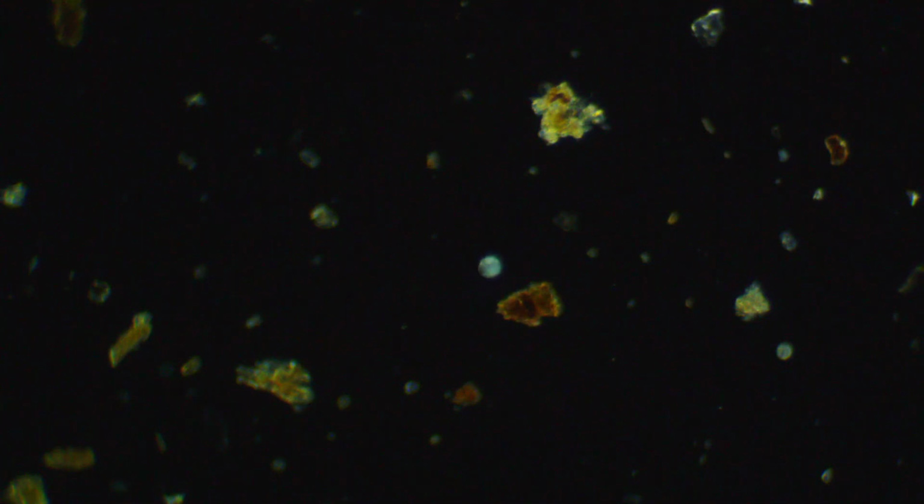Been thinking about other places to go around here. Guasti Park comes to mind, kind of a swampy place. I was thinking Guasti would have some interesting things to look at. This little soccer ball doing a little dance, just spinning around. Yeah, lake water? Yeah, that would probably work. Pond water, I think, is probably best, but the less running it is, probably more things you find in it, but I'll bet you'll find things anywhere. I mean, I know you will, pretty much. There's also a trail around here we've been wanting to go to try to get some samples.